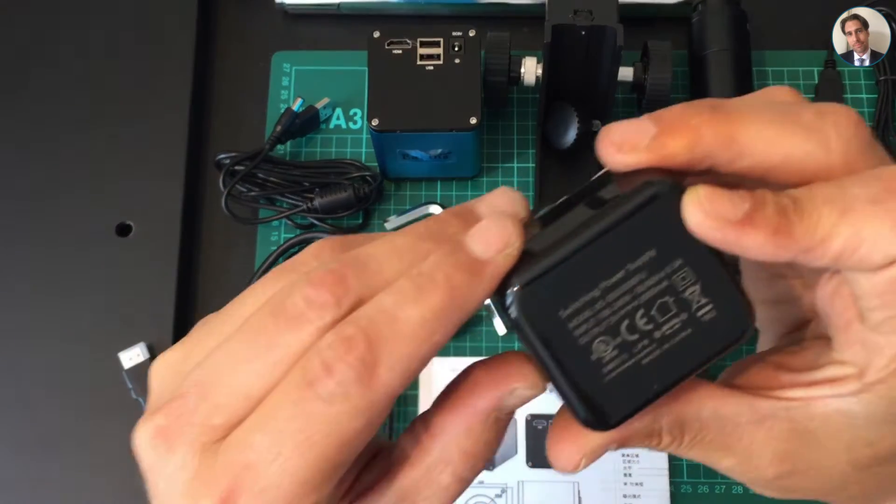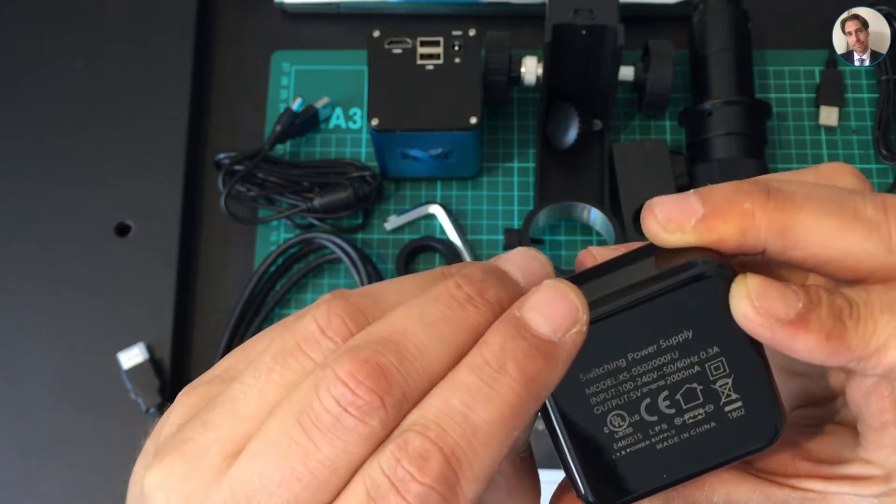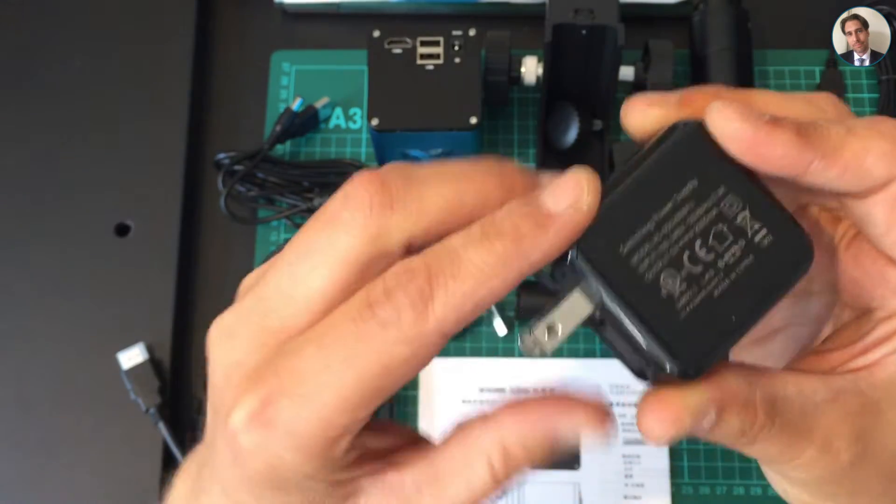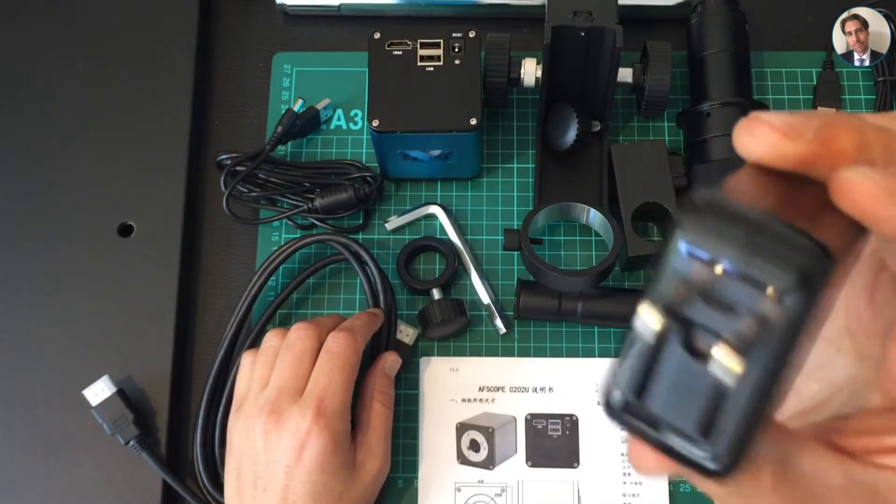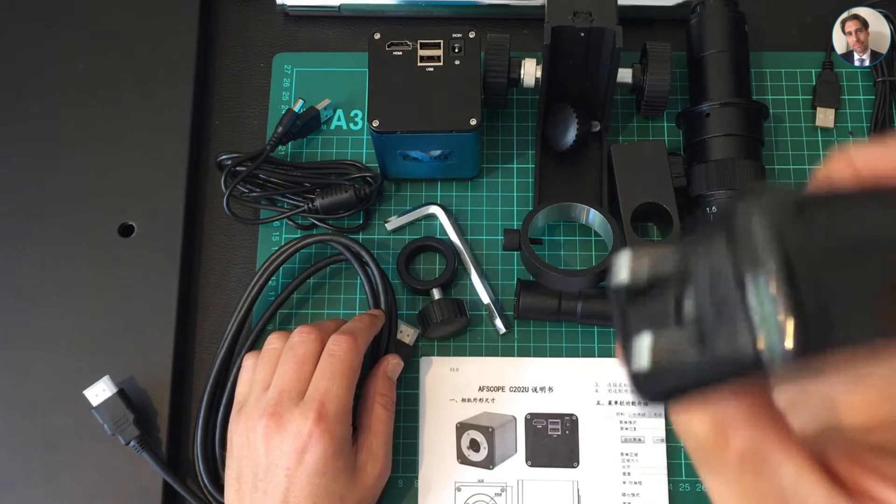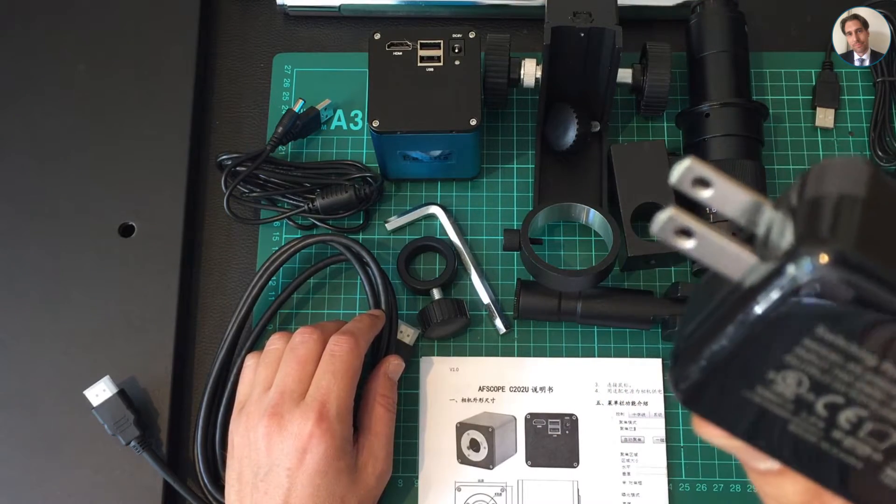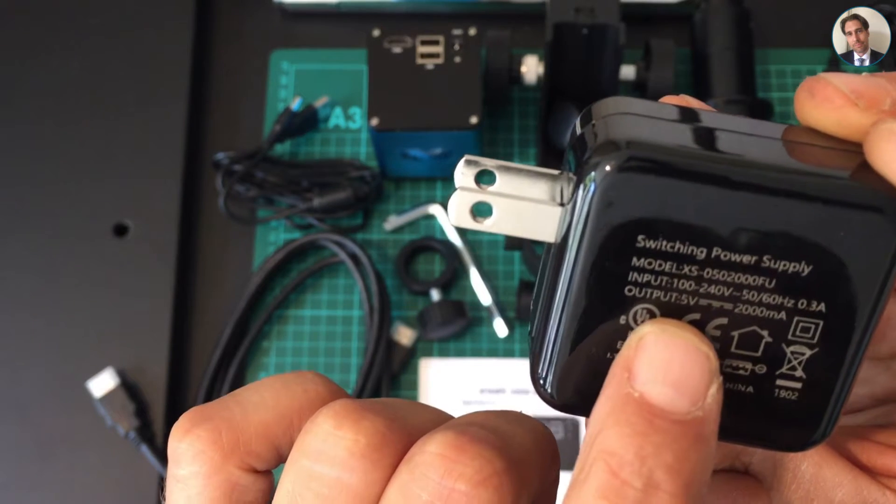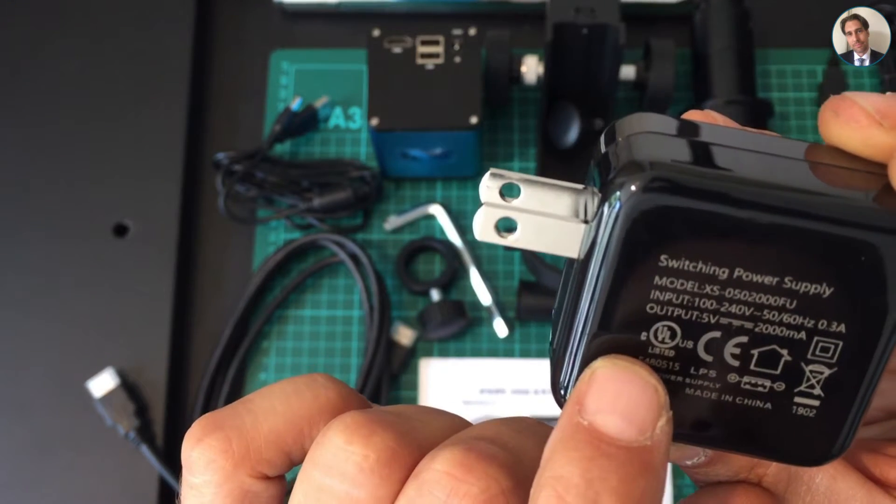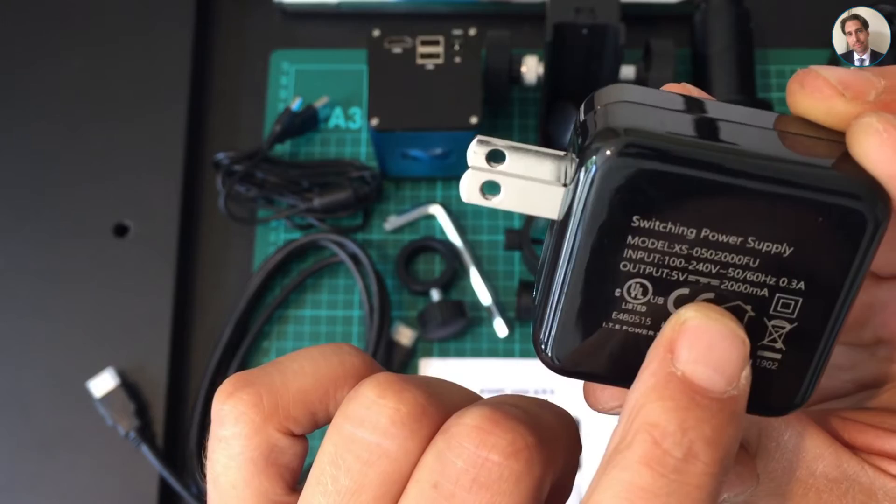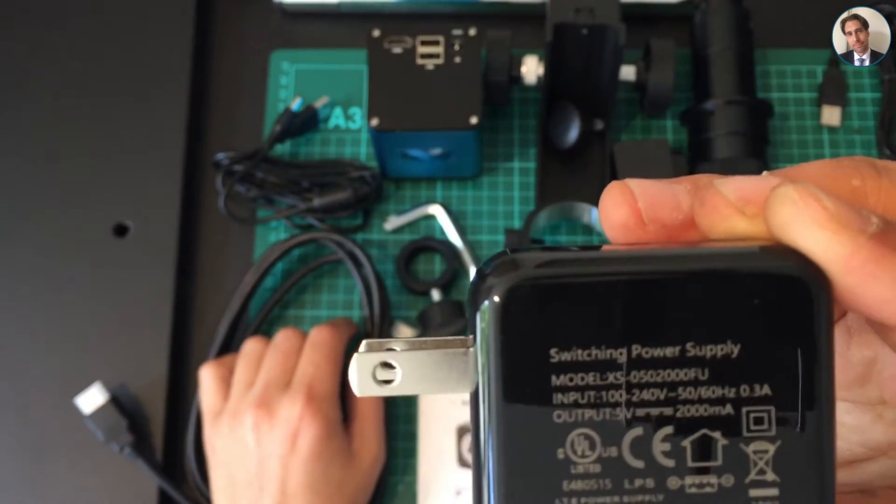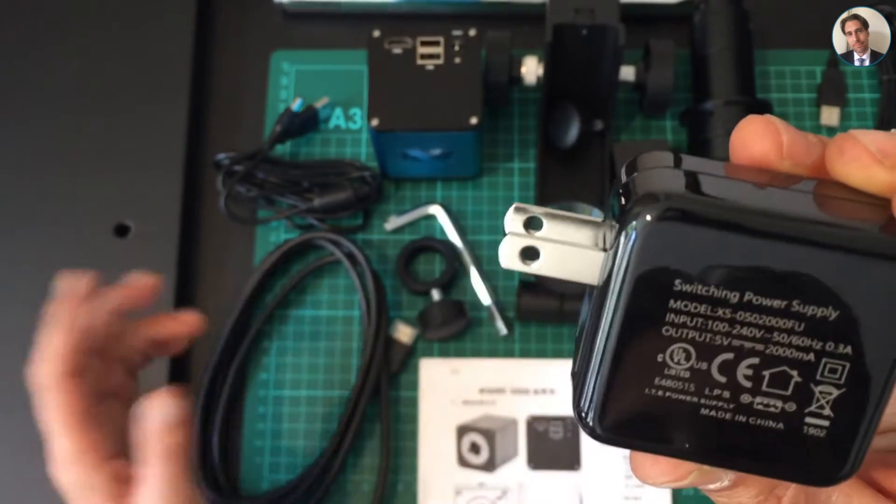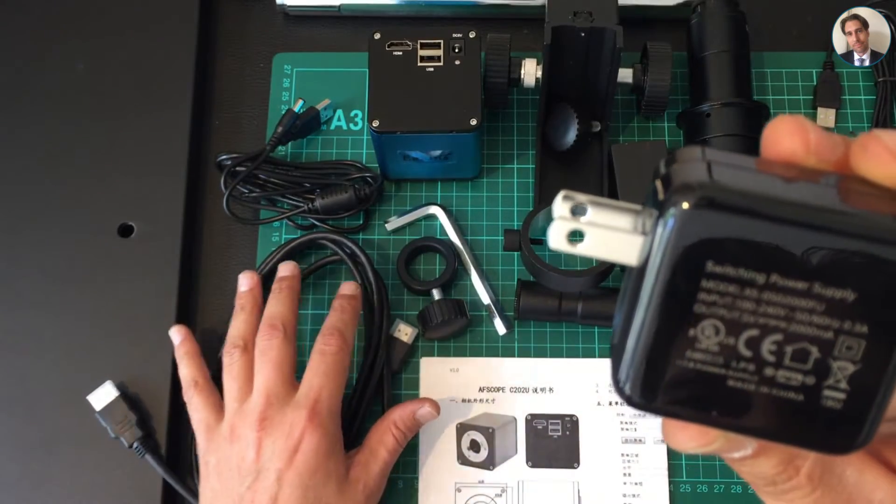...which is a power supply. Unfortunately, this is not the type of power connector we use in the Netherlands, but it says input 240 volts and output 5 volts DC at 2 amps. I'm just gonna use another wall adapter to use this USB cable and plug it in.